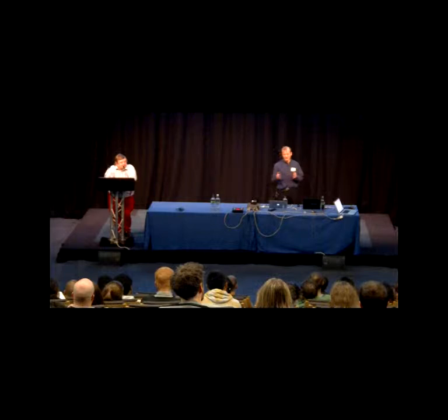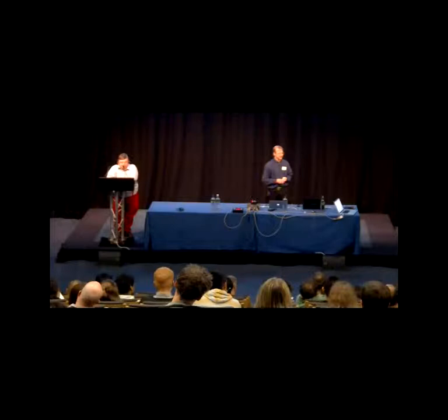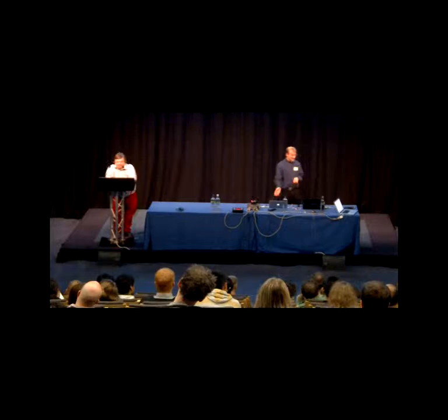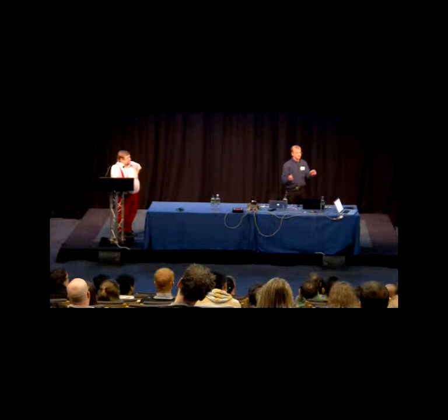Two last questions. Frank, then Martin. So you use the bit that you try and move, do you use only the backbone or the entire 3D environment? Because it might be preserved as well, right? It's a very good question. So actually, that's your option. That's a flag that you can set whichever way you like. The default, I did it in these cases with all the atoms, including the sidechain atoms. I meant the whole sphere around the CLF and not just along the backbone. Yes, it's the whole sphere. It's all atoms in the sphere, or just backbone atoms from something that's in that sphere. Either your choice.